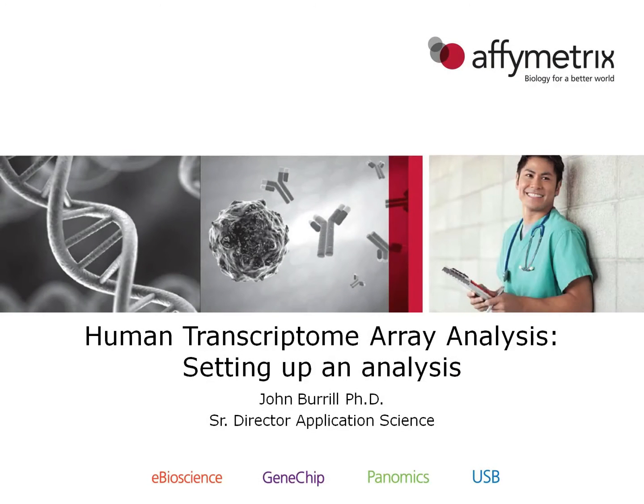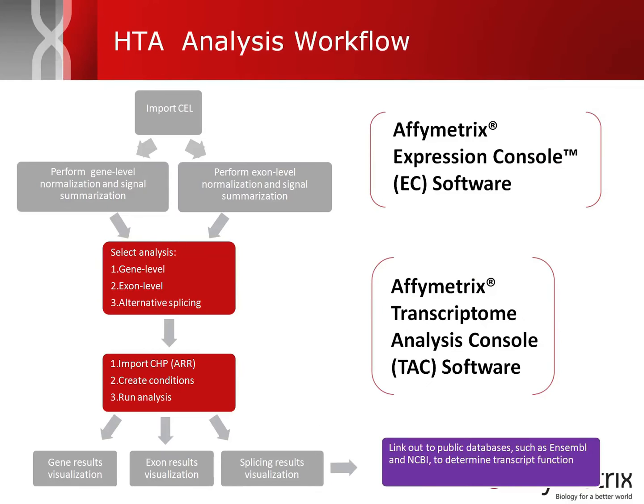Hi, and welcome to the video on how to set up an analysis for the Human Transcriptome Array. The Human Transcriptome Array analysis workflow consists of two different software packages available from Affymetrix.